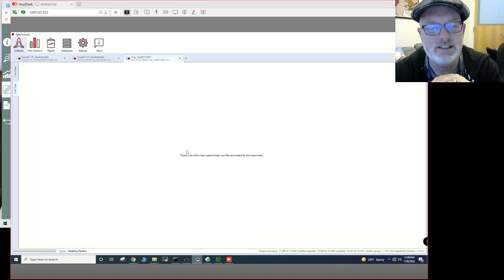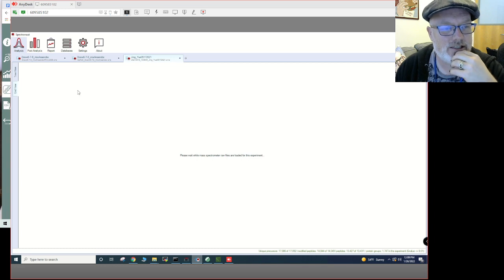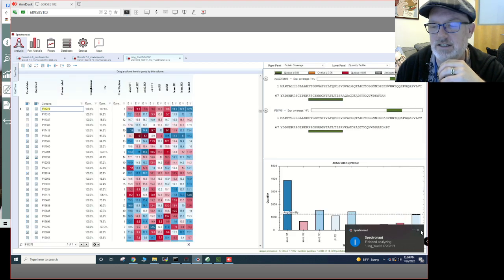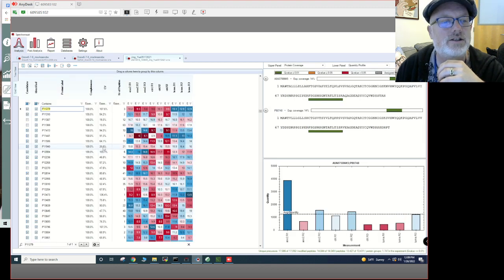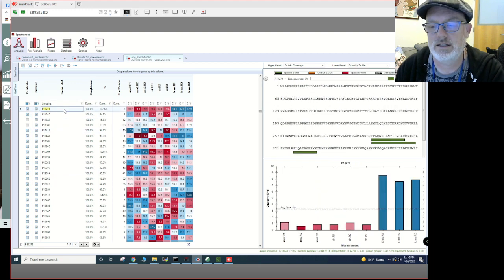And it doesn't actually take very long. So let's give it a minute and see. Almost done. And you can do this with the viewer, by the way, so don't worry about it. Okay, so it's done. Let's go back and type in P11279. And there we go. You can see imputation is turned on, so we all have a signal here.